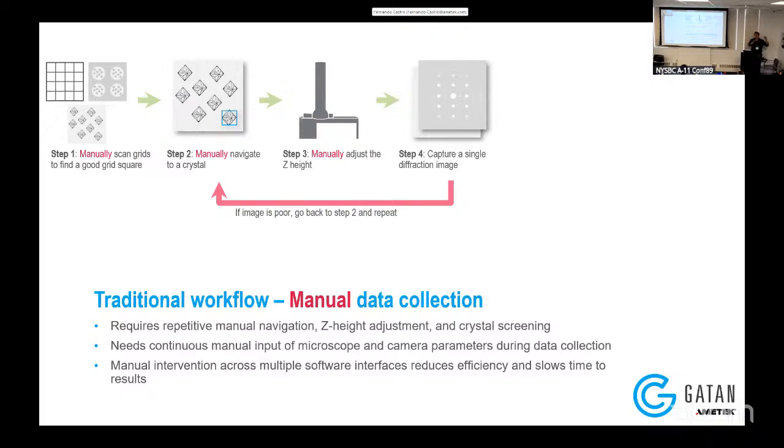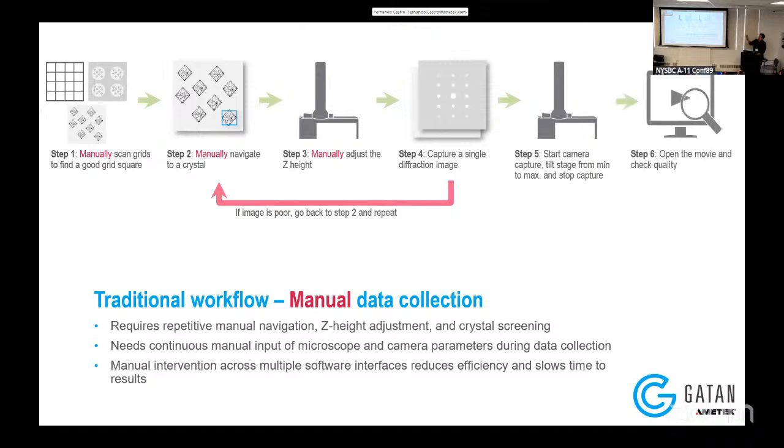And so something that I think material science does terribly is that we're happy to use this manual method for a very long time. And biologists were like, no, we need everything automated, and I agree. So having an automated solution to not have to manually adjust the microscope and the stage position, everything would be great.